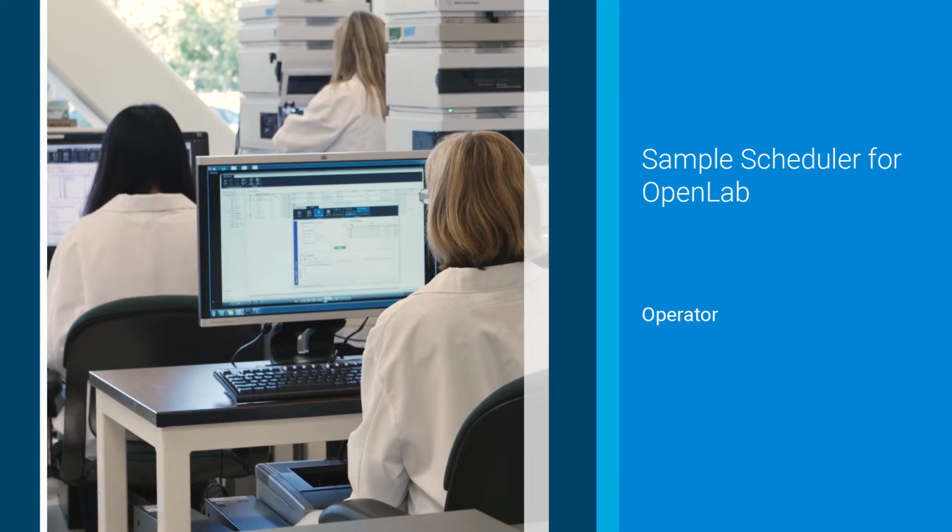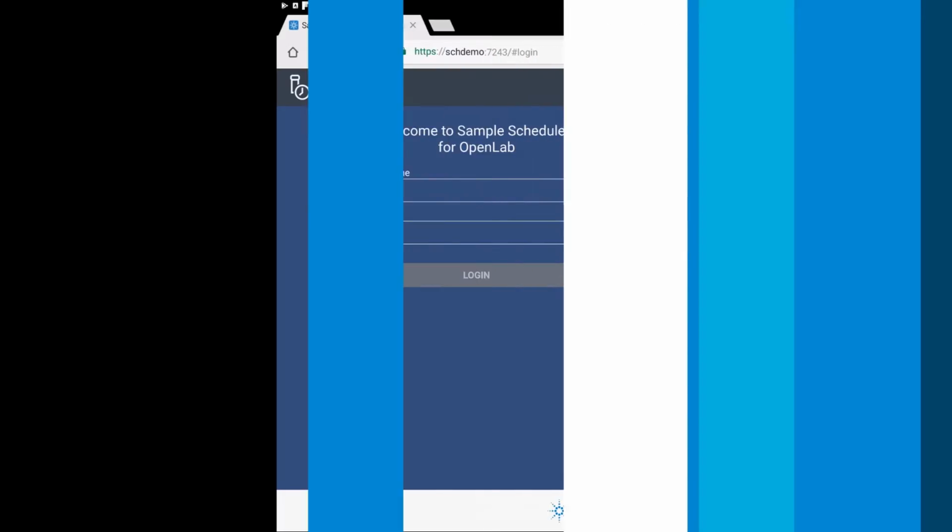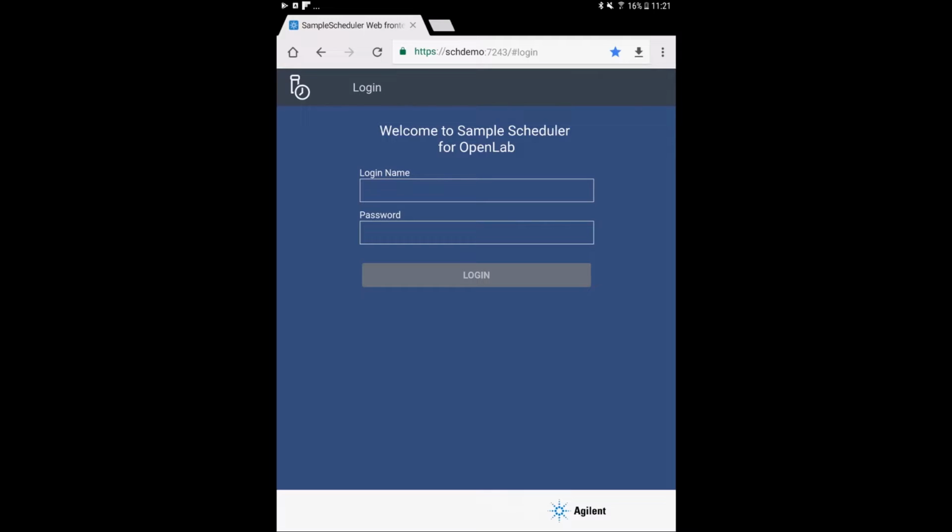Welcome to the Sample Scheduler web interface demo part 2, the operator. My name is Tim and I use a tablet for my daily work.